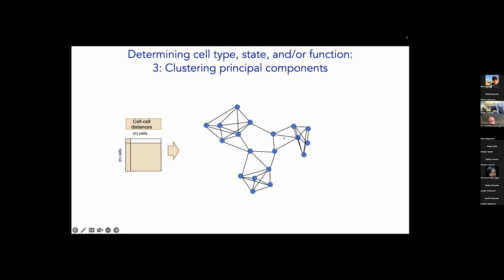And you can see that, once we've built the graph, it already becomes visually apparent where the clusters are. And this is called a K nearest neighbors graph. K is the number of nearest neighbors we tend to look at. And then finally, the last step of the graph is we look for shared nearest neighbors.